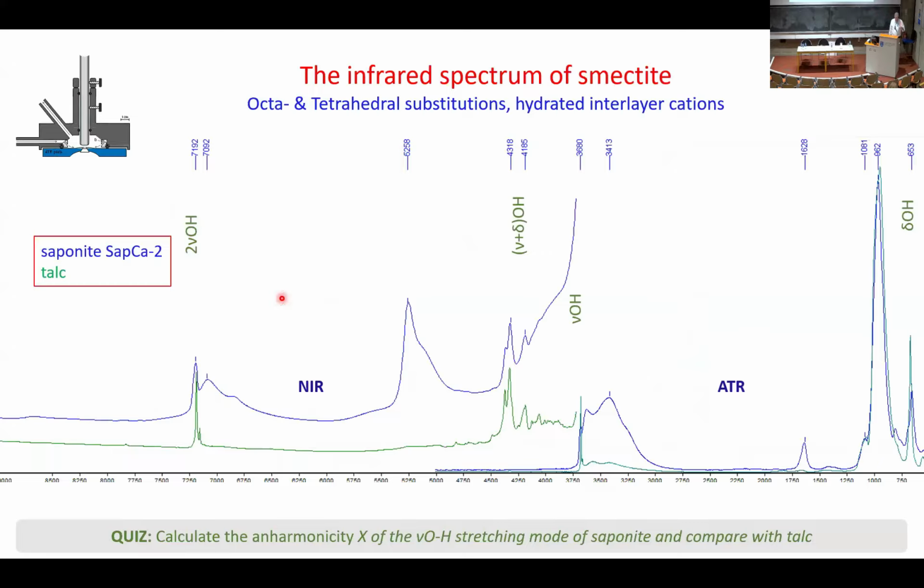Okay. Now, getting into smectites, let's do it a bit more systematically. Let's compare, we have seen talc. Let me put a trioctahedral smectite, that's a saponite, California from the CMS, in blue in comparison to the talc we had in the previous slide. Now, if I ask you to compare the two spectra, you would see that the SiO looks more or less the same. There is the sharp bending and the sharp stretching that we had before, these are the structural OH groups, slightly different, but they are there more or less. But there is an envelope here of overlapping bands, and there's another band here that were not there before, and this is water. This is molecular water. Different kinds of water, starting from the one that's decorating the clay particles all the way to bulk water at these conditions.